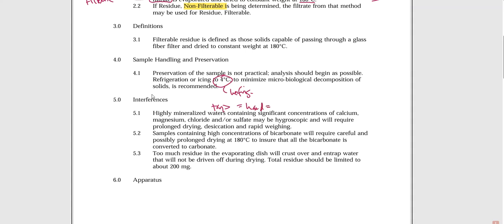And hard water, if you were part of our CTC 114 class, you did a water hardness titration. That water hardness titration focused on the amount of calcium and magnesium that's swimming around in your water samples. So what this interference is basically telling you is, heads up! If you've got a water sample with a really high level of calcium or magnesium or chloride, why would it have chloride? Well, again, tap water: they're chlorinating your water by the time they send it to your tap. They're going to try to kill bacteria and other nasty stuff before they send it out. So chlorination and bromination is pretty common. That's how chloride would be there, or high salt content.